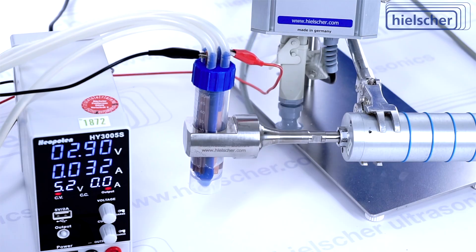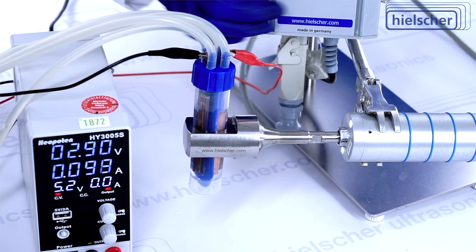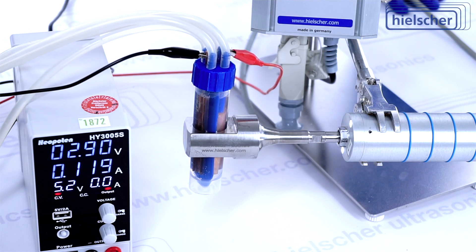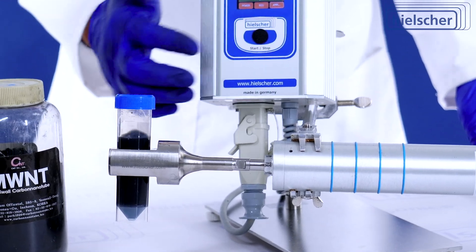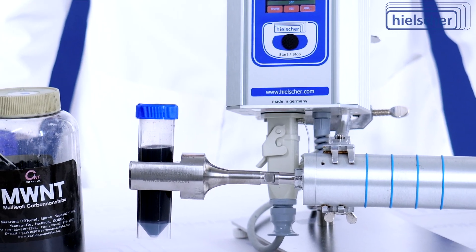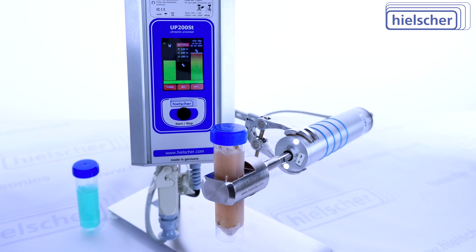The Hielscher Vial Tweeter is a robust platform that merges power, flexibility, and reliability. By eliminating the need for open-vessel sonication, it fosters a safer, cleaner, and more controlled environment for working with sensitive or reactive substances. The closed design also means far less solvent loss and reduced operator exposure, making this system equally attractive for academic laboratories, biotech startups, and established industrial facilities.